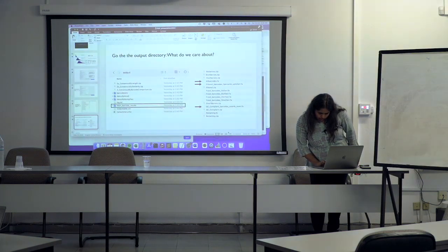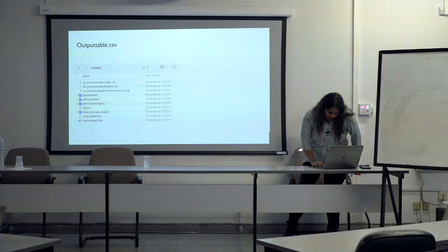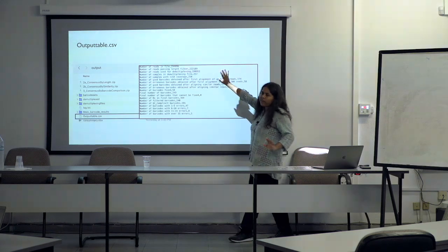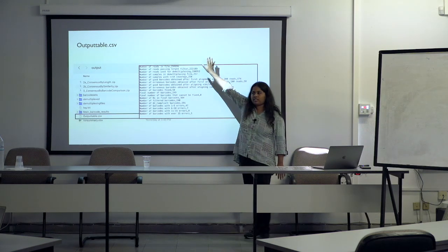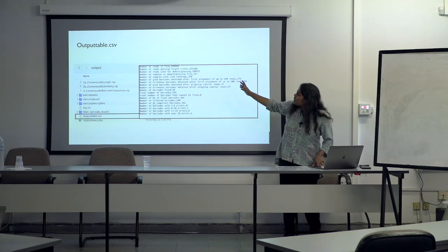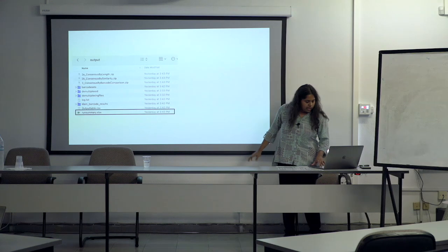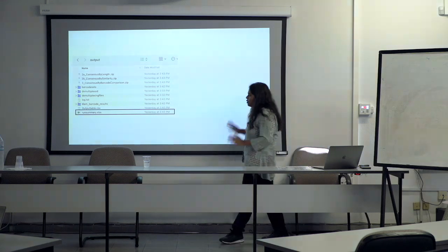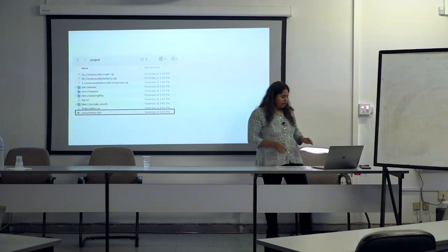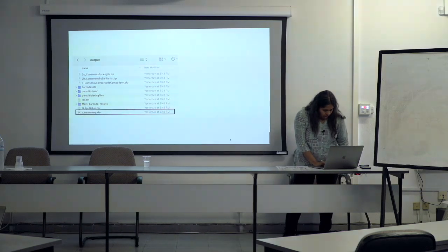That's your barcode sets. Then you have the output table, which is basically a copy of the result summary tab, printed here if you manage to close the software. And the run summary is one thing you might want to use if you don't want to just go by default recommendations and you want to play around with coverage. It's an Excel sheet that gives you much more detailed information.